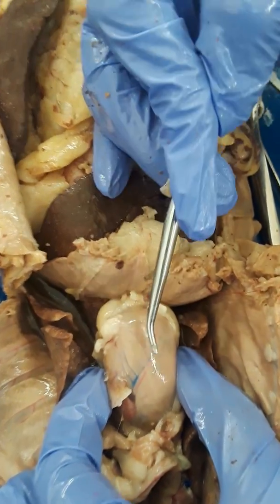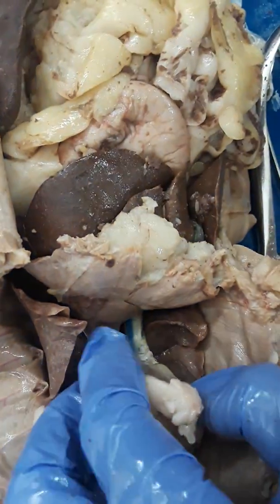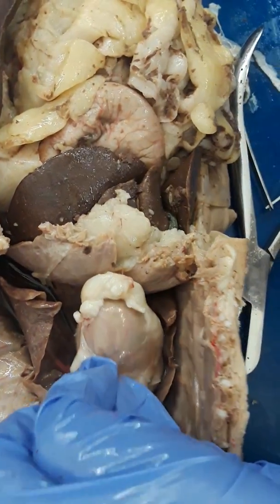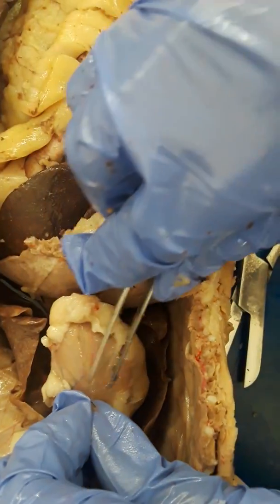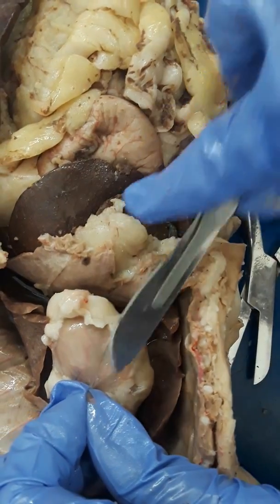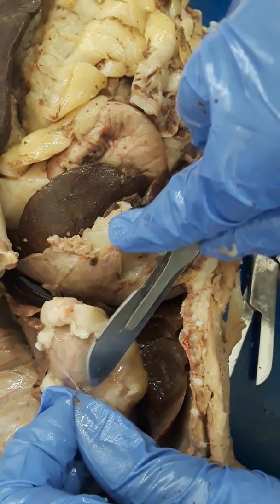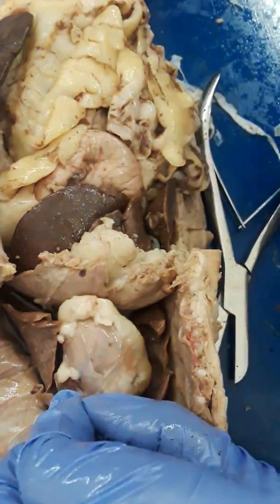Those are going to represent the coronary arteries and the coronary veins. Surrounding the heart is the pericardial sac, which is here. So you can actually remove this. And what's coming out right now is the pericardial fluid, okay?